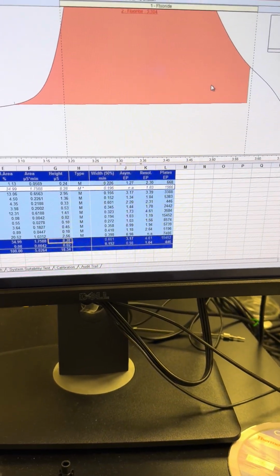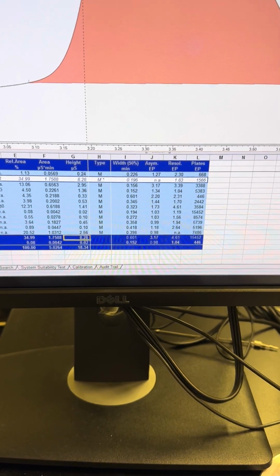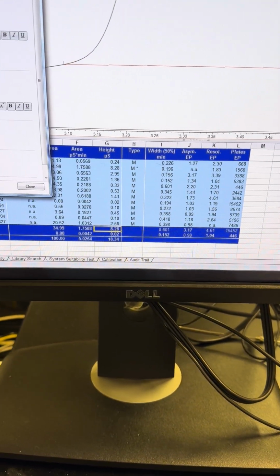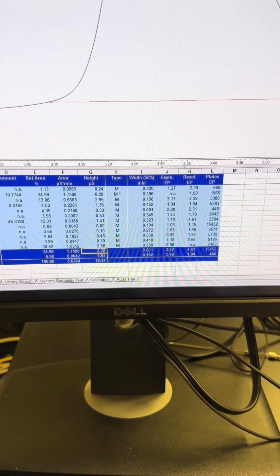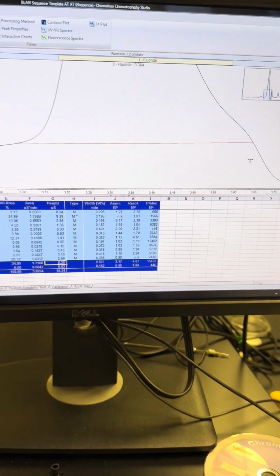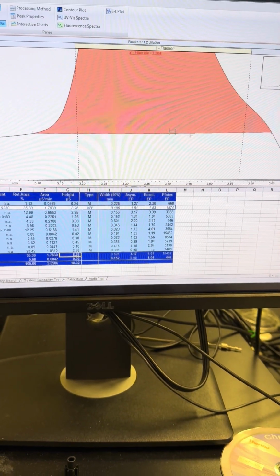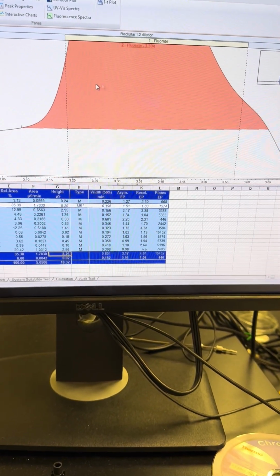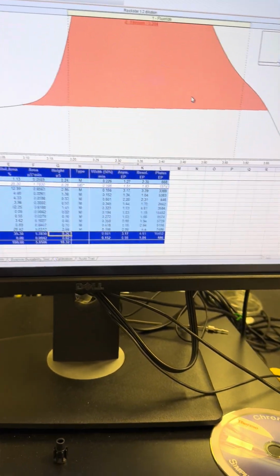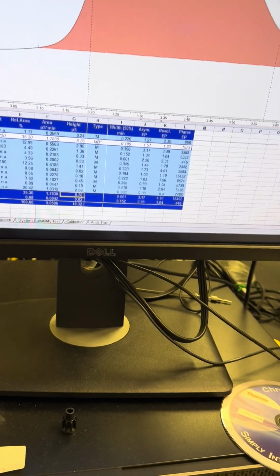Okay, so we set that, perfect. We want to include this, hold on, sorry. Okay, there we go. So we're going to want to do that, and then see, it's flush with the baseline. Before it was all sideways, you don't want that.